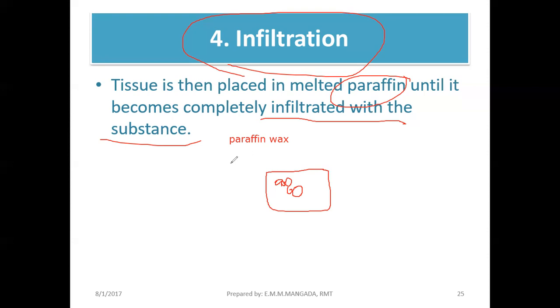Unlike 'pag hindi siya frozen, sa Ilocano loppoy, yung parang crumbly siya, 'di ba? 'Pag ginalaw mo mataba siya, shaky-shaky siya. But with your frozen na pork, 'pag ginalaw mo siya, very firm kasi siksik yung loob dahil nga puno nung ice crystals. So ganun din dito sa infiltration.